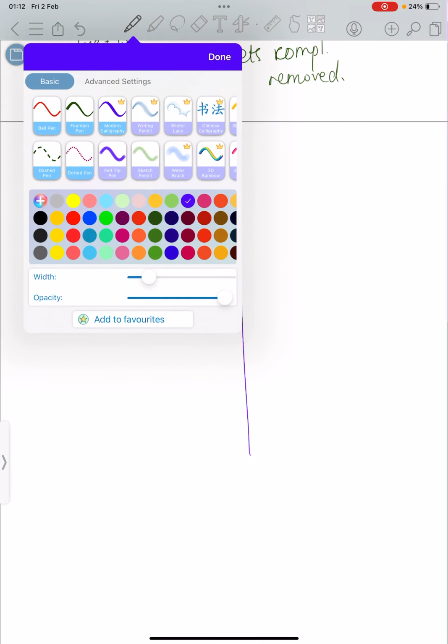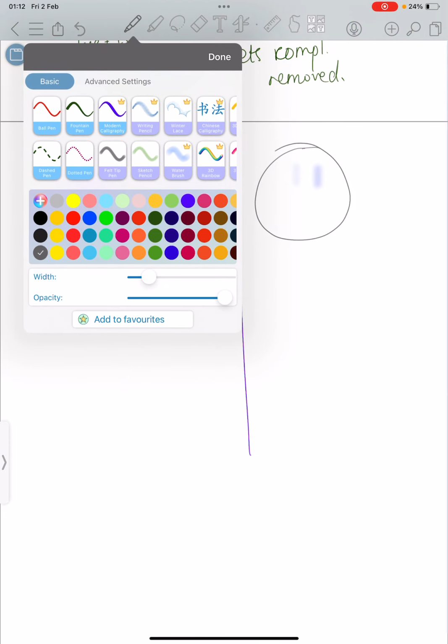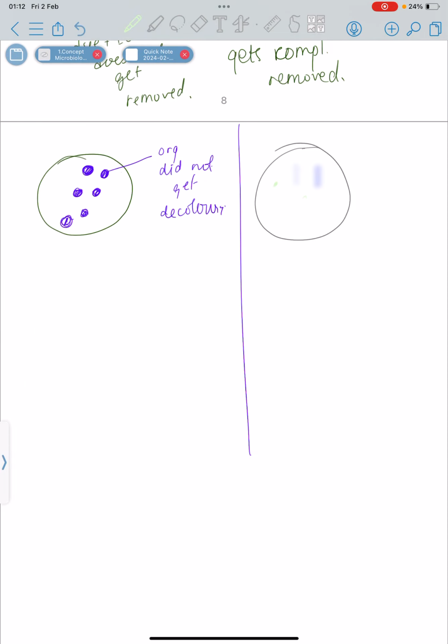But in the case of gram negative organisms, what happened is that we put this stain. Suppose these are the organisms. Firstly they took the stain, but when we applied decolorization, all the stain was gone. Clear? So till step 3, this is all that happened. Now comes step 4.